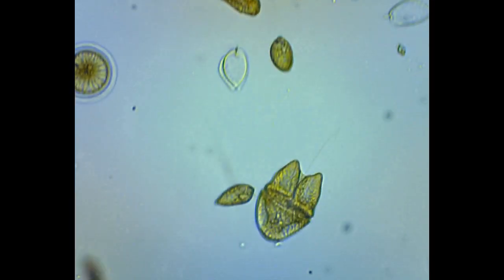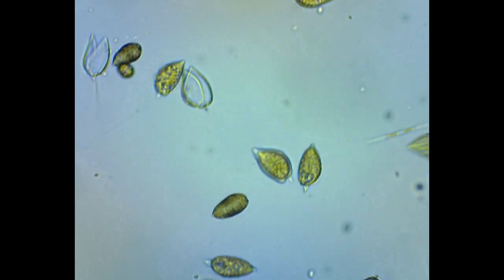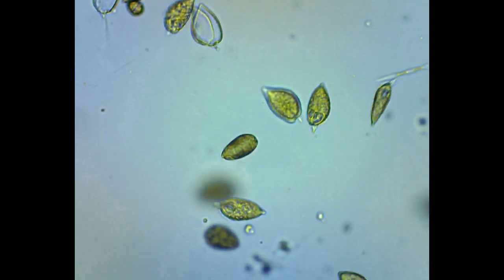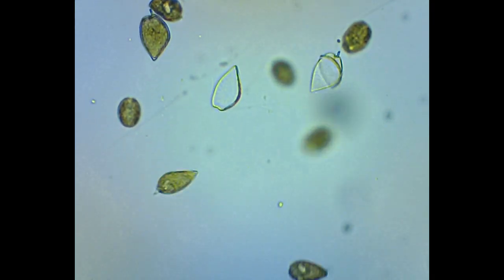Here we're looking at a plankton sample collected from the Santa Cruz wharf. It's dominated by dinoflagellates, mainly proracentrum plus a few akashiwo.